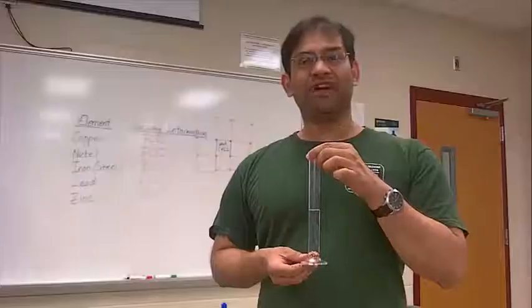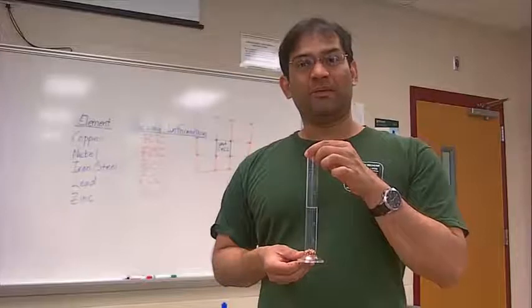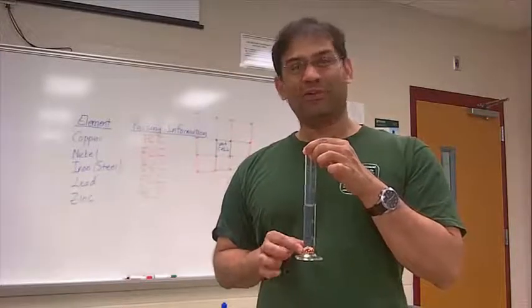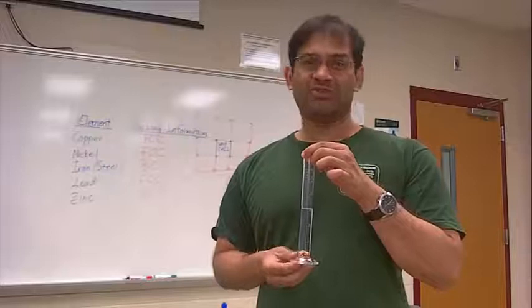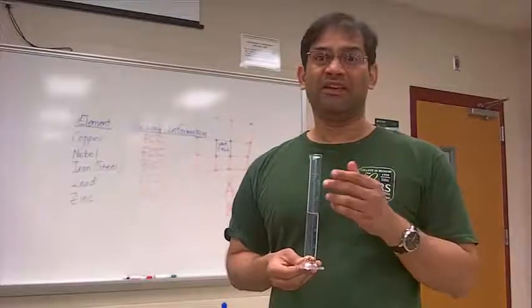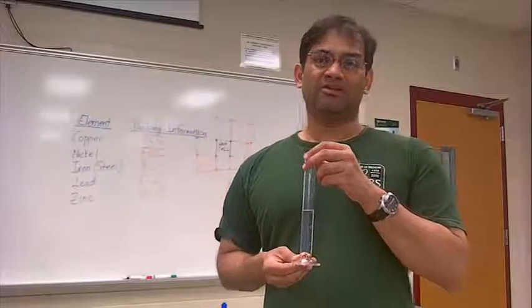So after you measure out the volume displacement of water, there's a note I want to tell you about waste. Don't throw this away. We will recycle this. So dump out the water and put this back in the appropriate container. We will let the copper dry and we will use it for other experiments and the other labs. So don't throw away the metals. Put it into its proper receptacle when you're done.